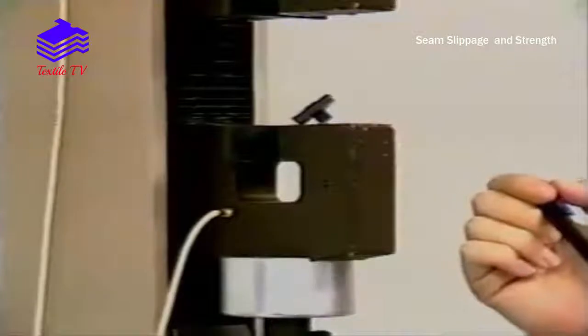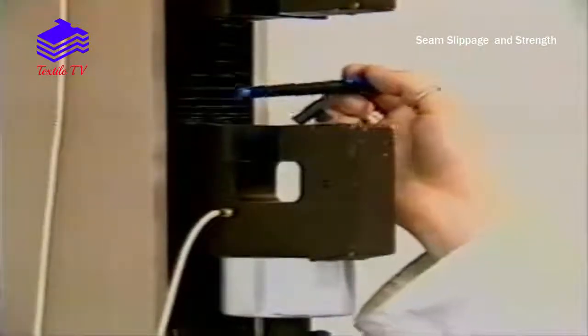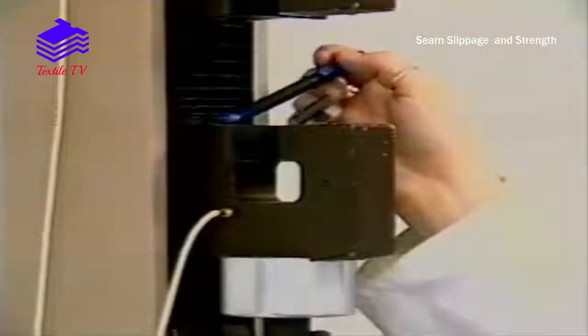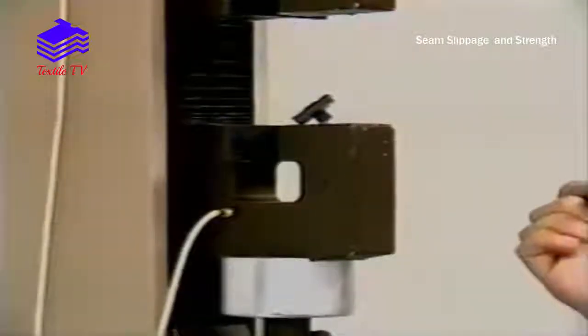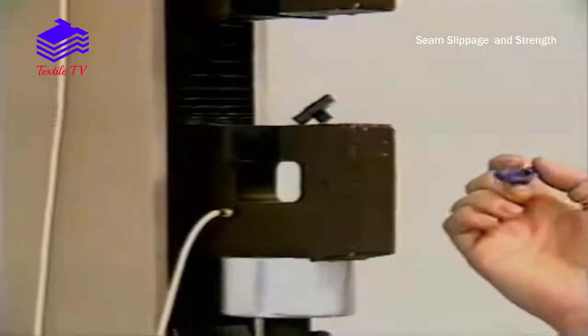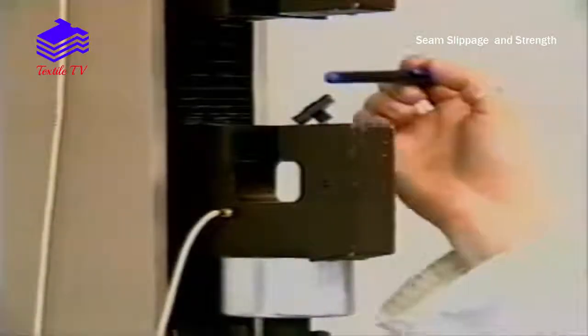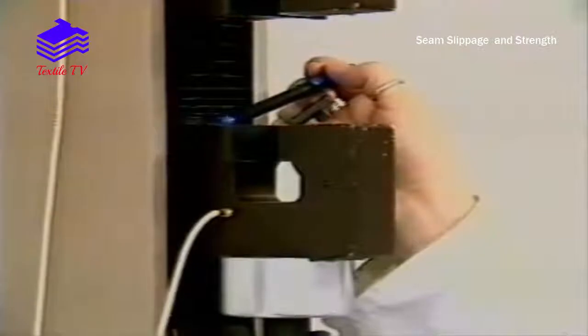The Hounsfield is set up with correct jaw faces in both top and bottom holders. The back jaw being 75 by 25 millimeters and the front face being 25 by 25 millimeters.